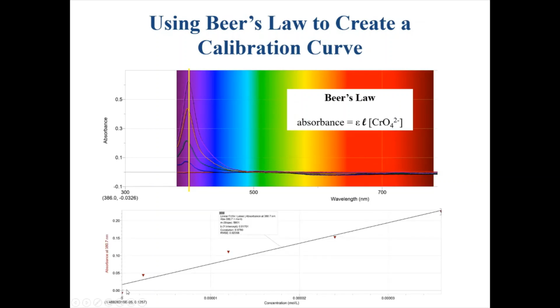What you'll find is that you get a nice linear relationship. Just so that you don't get confused, this data is not the data that's in your experiment. I'm just using this data as an example. This was from another student's Vernier setup. The data that you have is different, so don't try to reproduce the data from any of this. But anyway, it's the same idea.